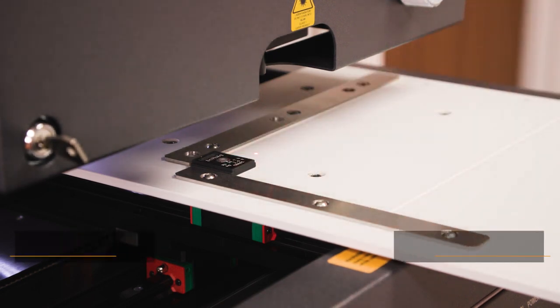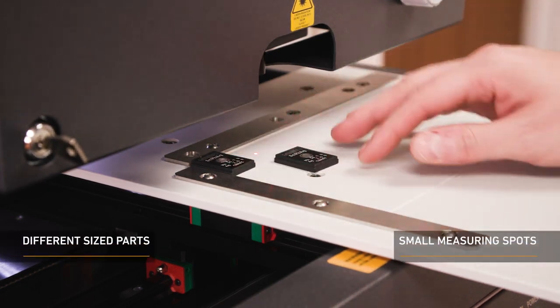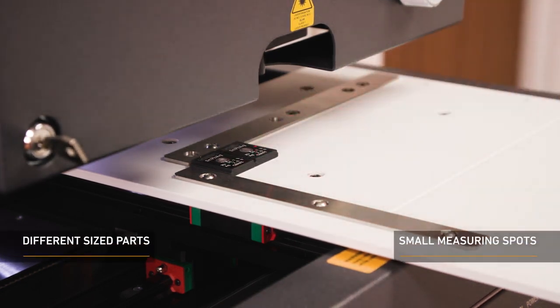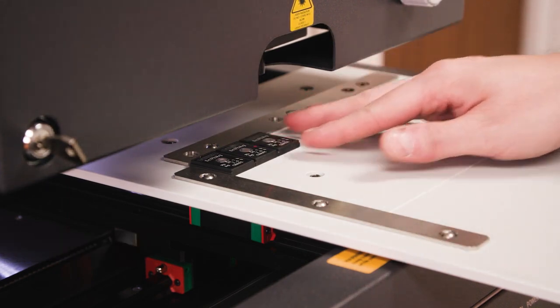With this instrument, the smallest sample size measurable is 0.3 mm. This makes this robust instrument perfect for measuring small areas on items such as connectors.